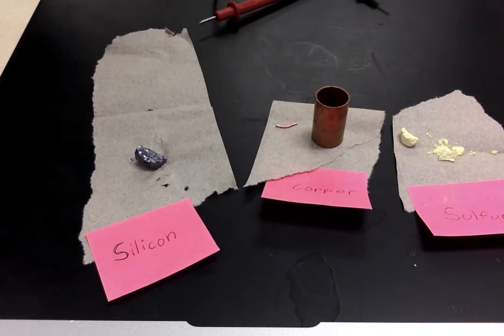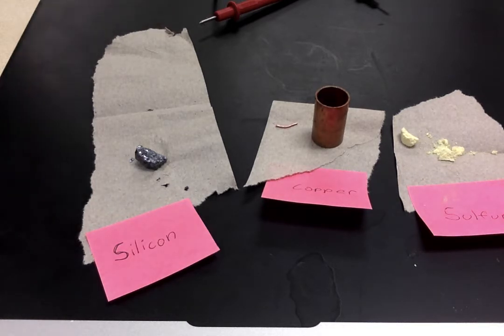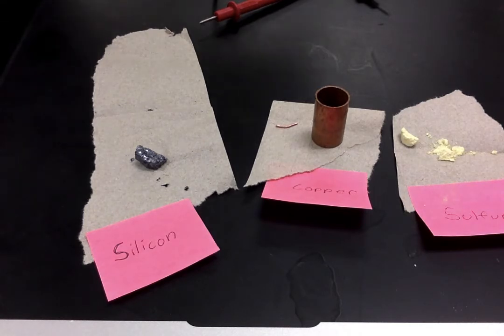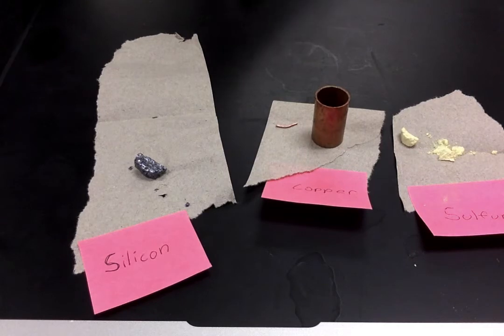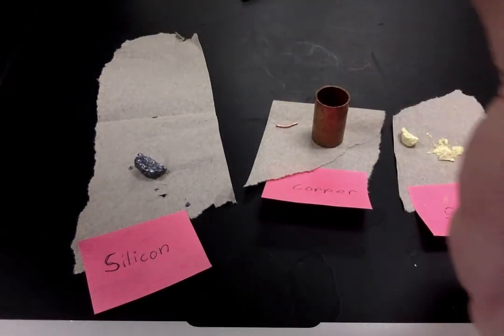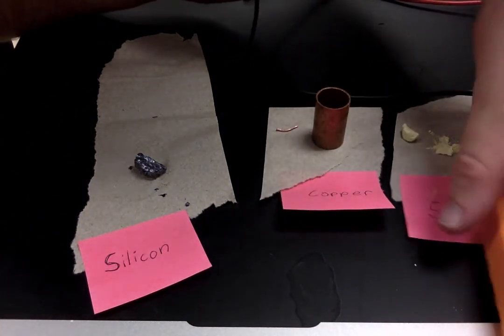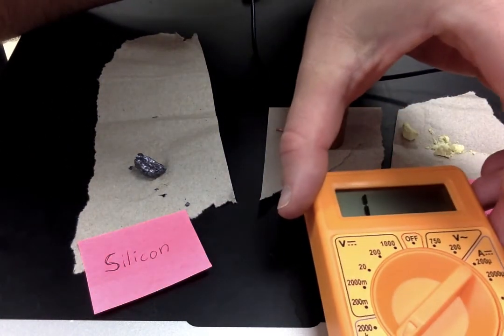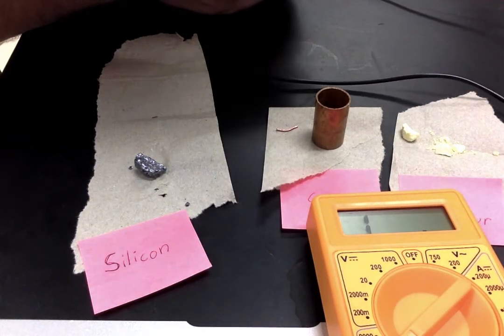Okay, and then our final experiment is conductivity, and we're talking about electrical conductivity. So we're going to judge these on how well they conduct electricity. So here I've got a multimeter. I kind of wish I had brought mine from home because I'm not super familiar with this one. Oh, you guys can't see that. Perfect, right there. And you should be able to read the number on there.